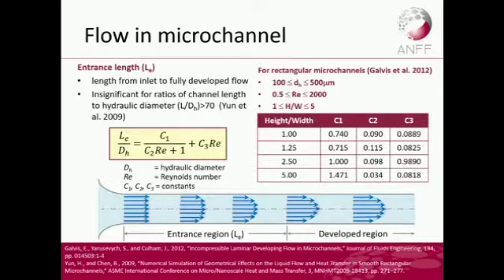The entrance length is basically the length it takes for the fluid to stabilize and create a parabolic flow, or a fully developed flow. Because at this stage it can be chaotic, changing, or unstable, and that might interfere with your experiments.